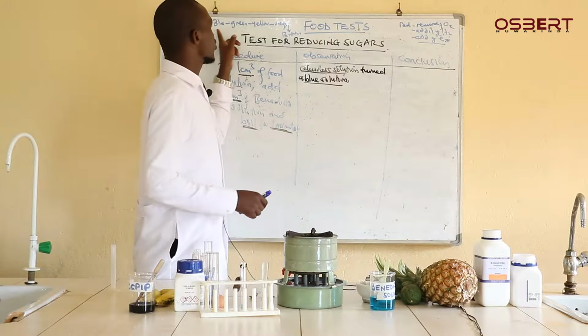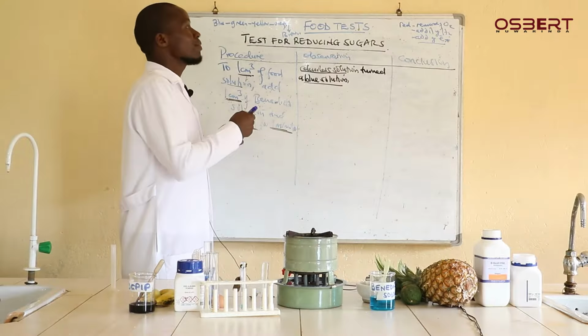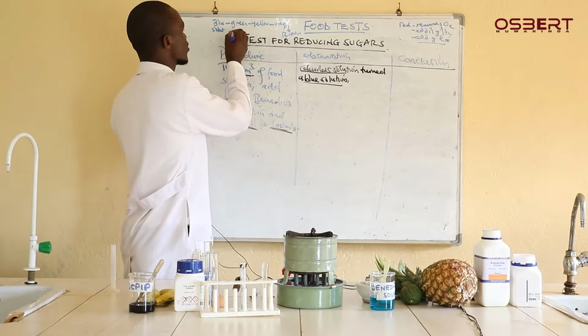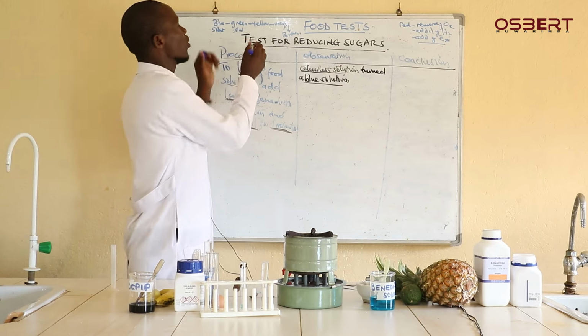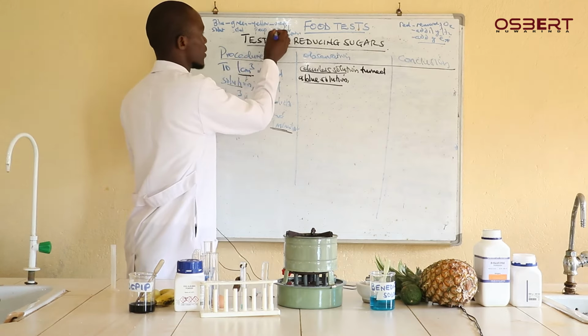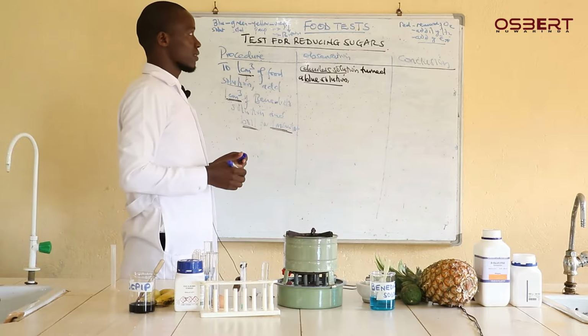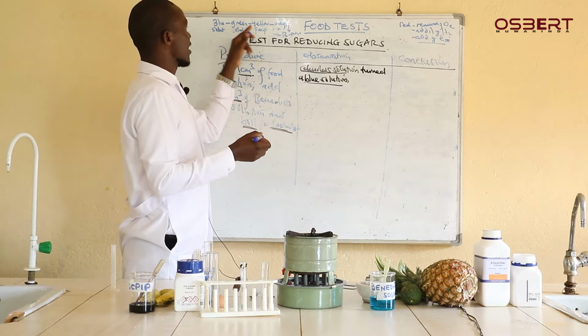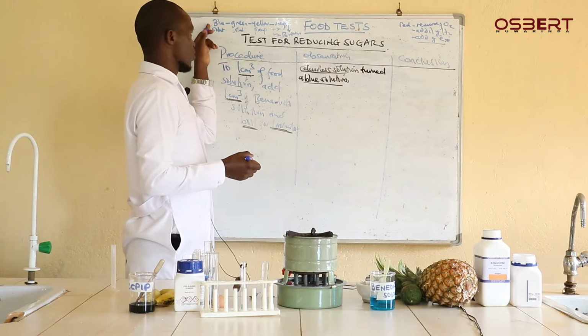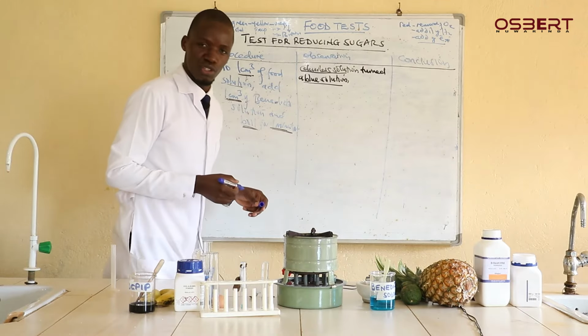One thing you need to know about this is that chemically, blue is a solution. Chemically, green is a solution. Yellow is a precipitate, and all these ones are precipitates. So chemically, the yellow, orange, brown are all precipitates. But blue is a solution, green is a solution.